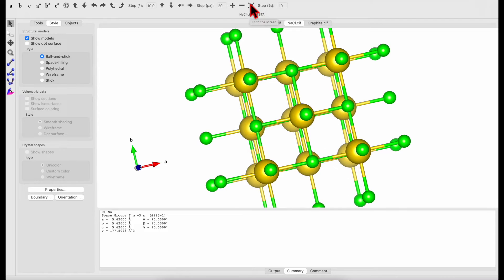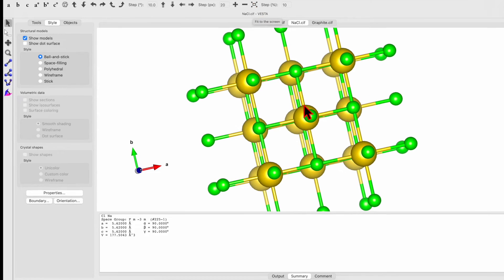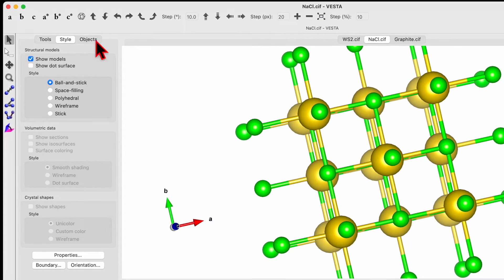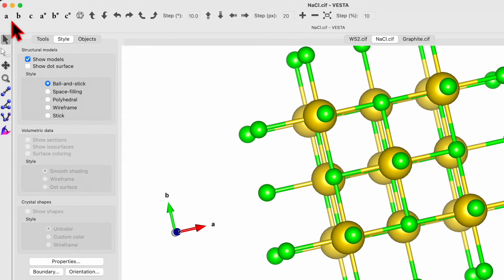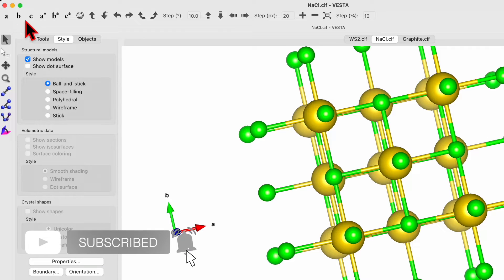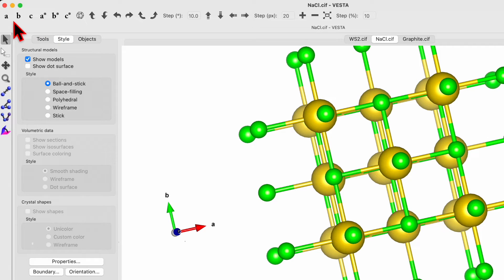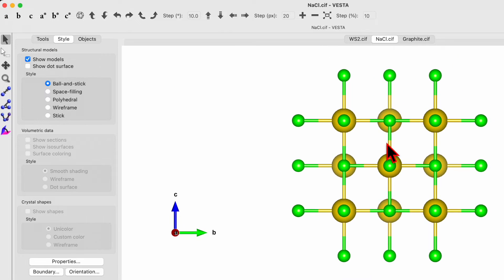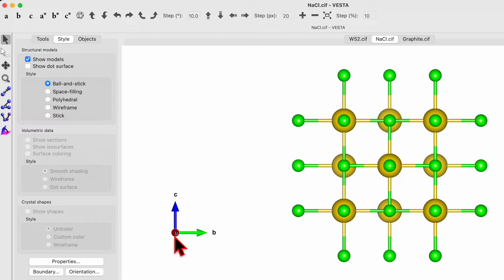If you click this one, fit to the screen. And then on this left hand corner, you will see ABC and A star B star C star. That A means view along the A axis. So this is how it will view along the A axis. That also can be confirmed from these arrows.